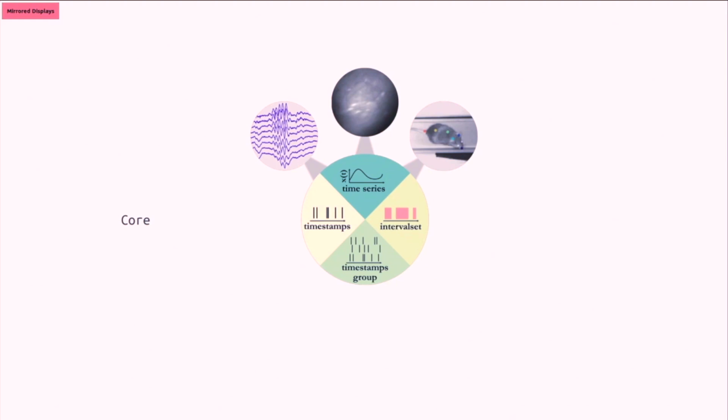But so far, I think it's a good approach. So this is the core. Then one layer above, which we call the I/O, or input-output. Of course, we are targeting systems neuroscience, so we show here 3 bubbles that show electrophysiology, calcium imaging, and behavior.